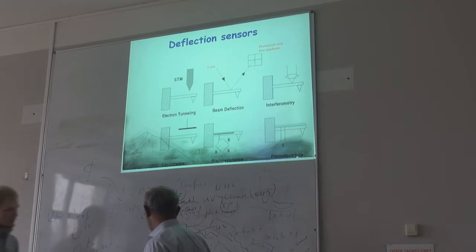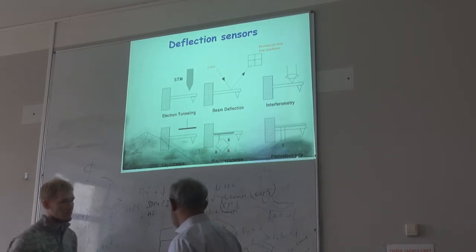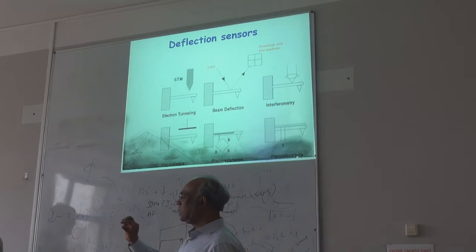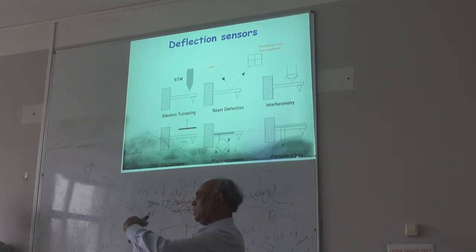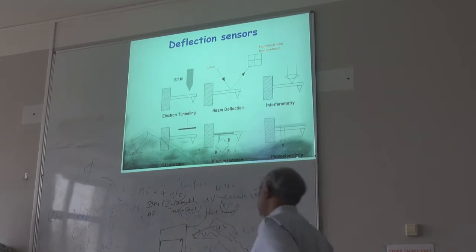And you can decide on one layer. So typical one layer is about 0.7 nanometers because there is some air between the substrate and the first layer, and also some van der Waals force. So usually this thickness is about 0.7 nanometers.